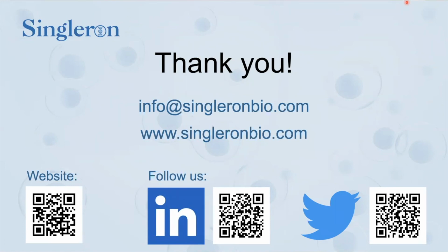And in this case, you can get away with low throughput systems. Also, it depends on what type of machines or what type of technology you're interested in. For most of the techniques, you need to purchase bulky machines, instruments to perform those. This is also something that one needs to consider. And those are the things that I can think of at the moment.